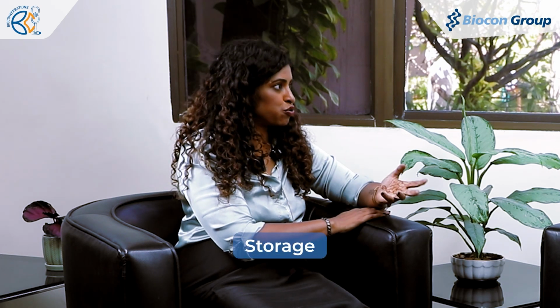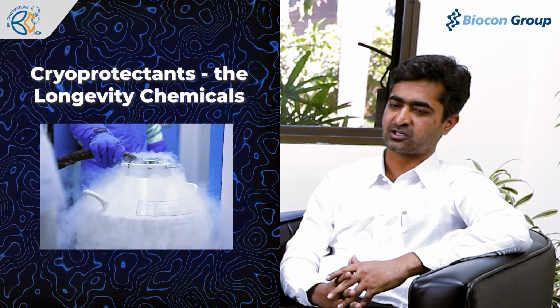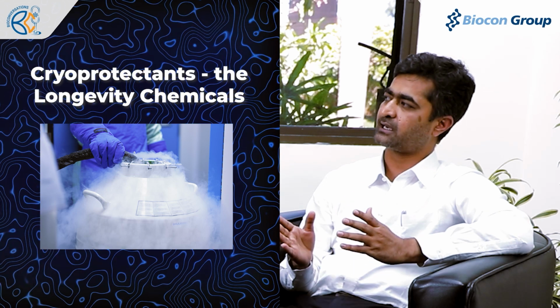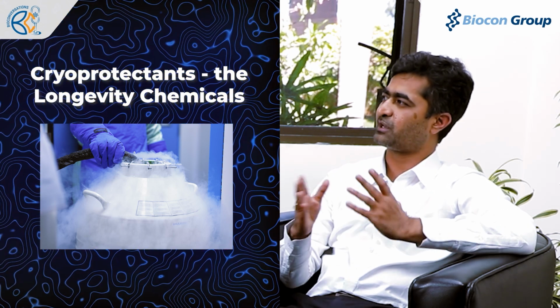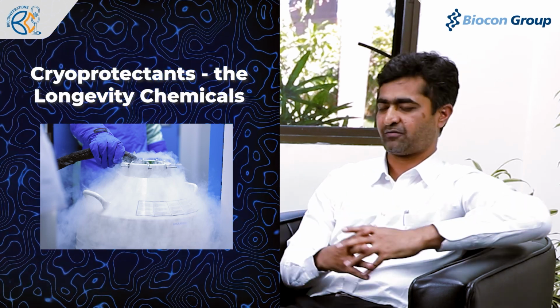So when you store these cells, you mentioned they are at ultra low temperatures. Is there a specific nature of the container that you look at when you are storing this? Because obviously glass-like materials will break at that temperature. Yeah. So I wouldn't go into much detail about the material of construction, but they have to withstand those lower temperatures, and that's the easier part because many materials are available.